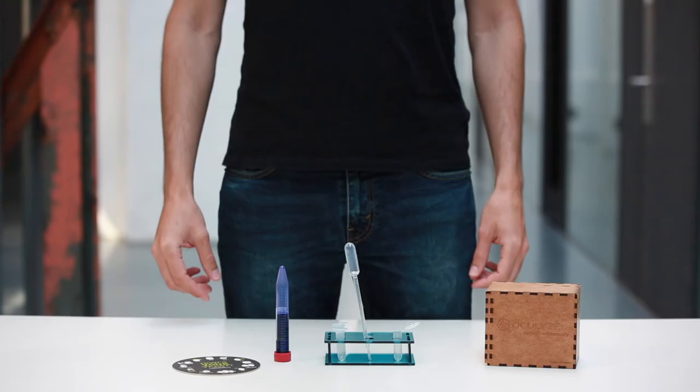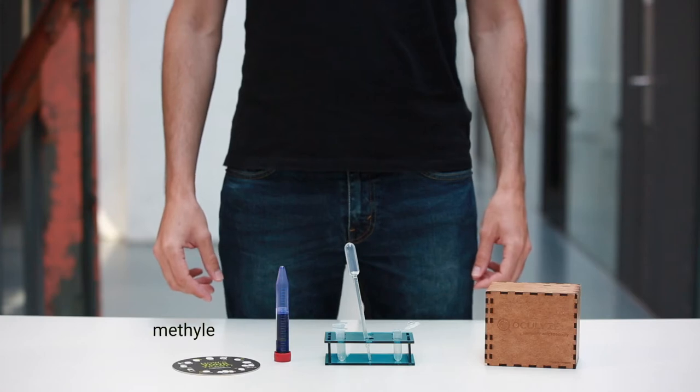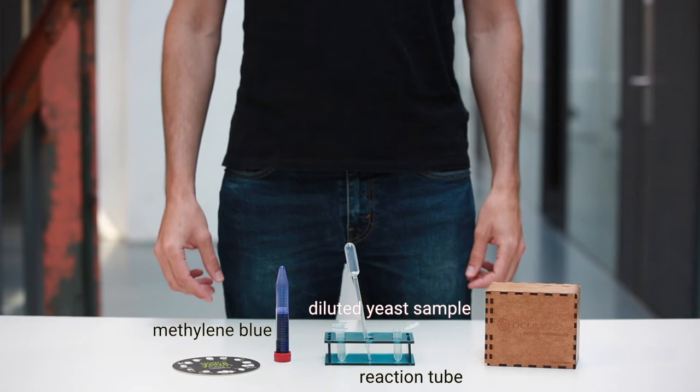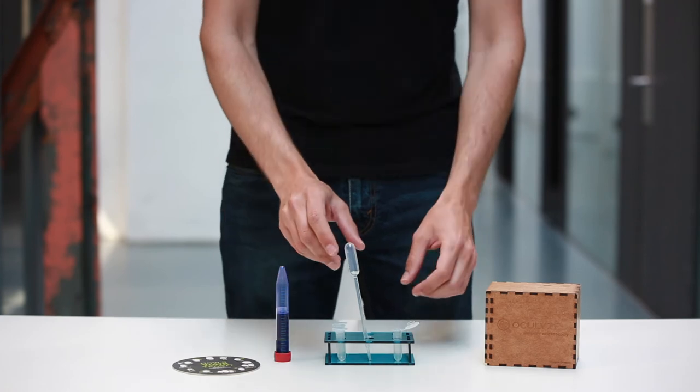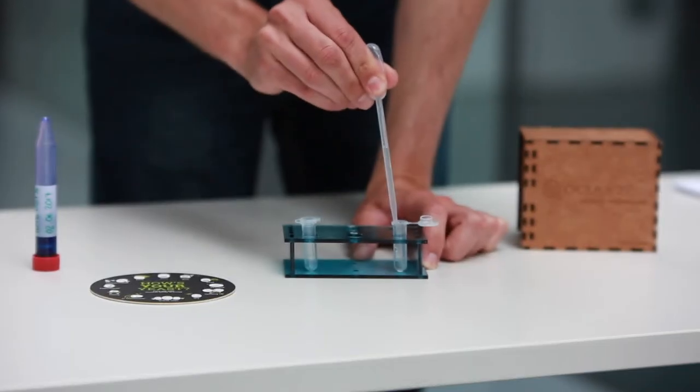In order to determine the viability of yeast, it must be stained with methylene blue. Here is what you'll need for staining. Step 1.